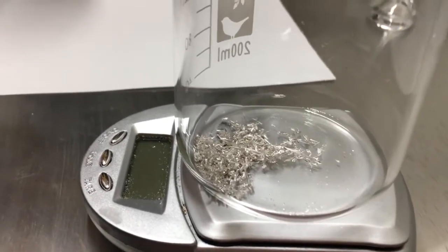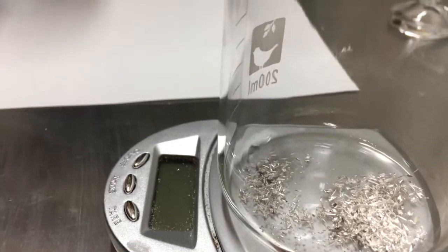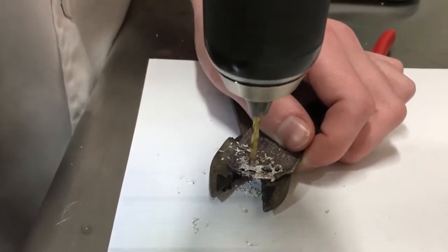Drilling enough shavings does take a while though, so if you plan to make a large amount of silver nitrate, I recommend just using the form the silver is already in and waiting a while longer for it to react if it is in a bar or a coin.